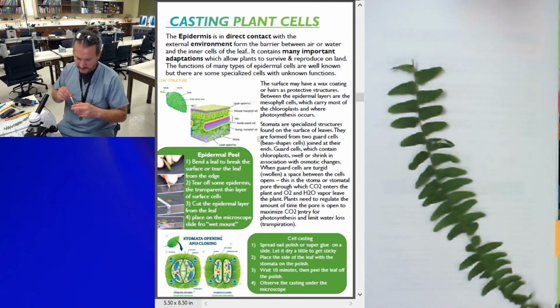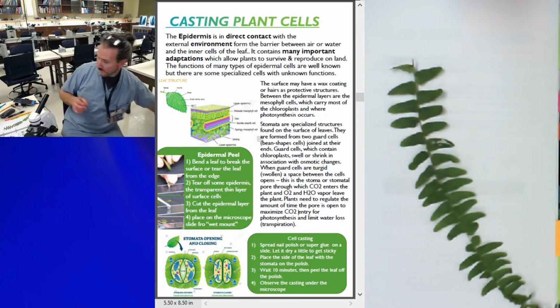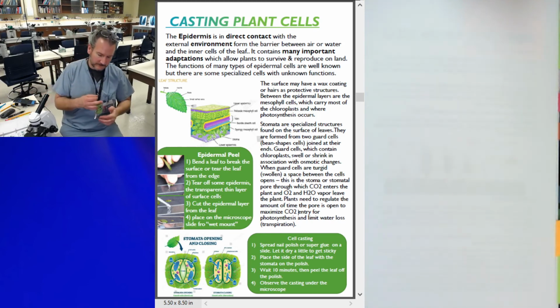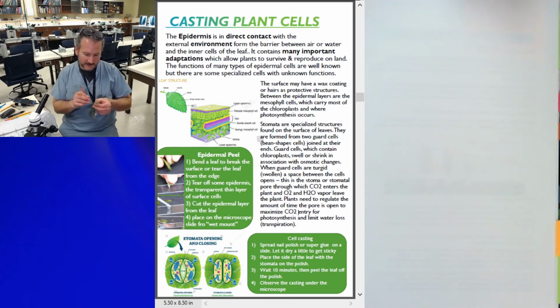Dry on the leaf. We cut a little piece of tape. I'm going to take that leaf, I'm going to put that fingernail polish and the leaf right there on the tape. I'm just going to try not to get too many fingerprints on here. So I'm just pushing it down with the back of a brush.